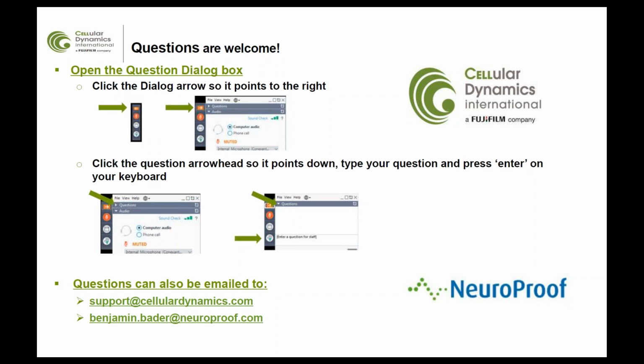So high glutamatergic agonists at higher concentration, they tend to decrease the number of active electrodes and therefore also the cellular health. So that's what we can say, that this is then a readout where we can use the number of electrodes as a measure to look into excitotoxicity, and the activity drops down also.